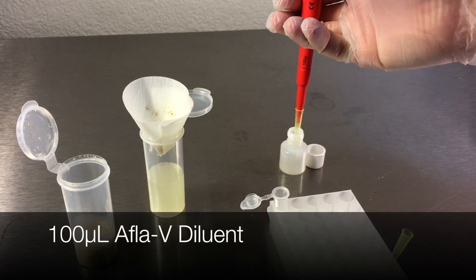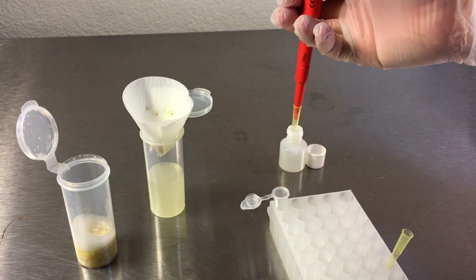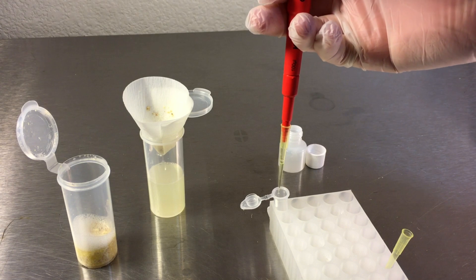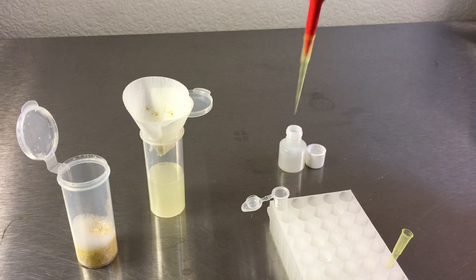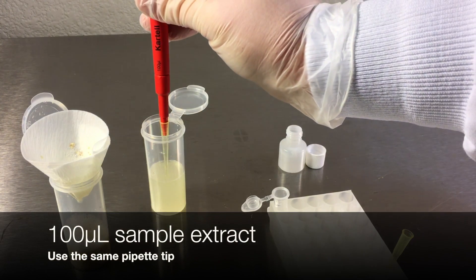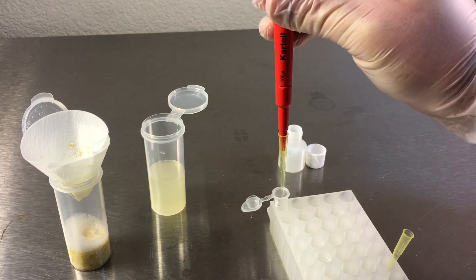After filtering, transfer 100 microliters of AFLA-V diluent to a new strip test vial. Using the same pipette tip, transfer 100 microliters of filtered extract to the strip test vial.